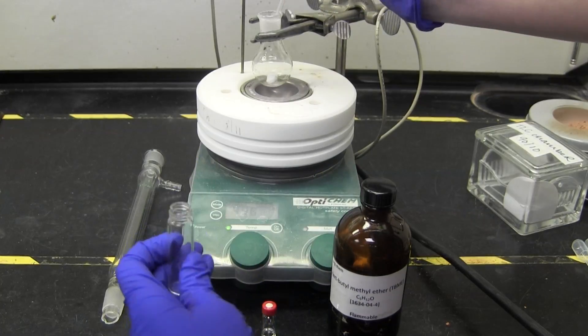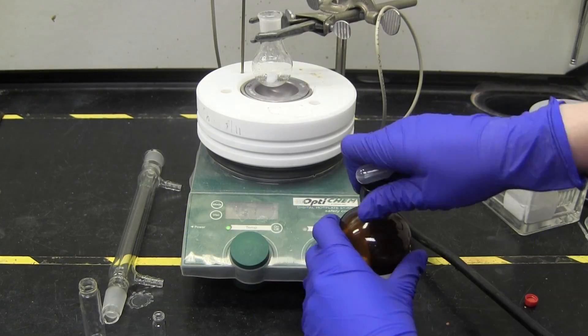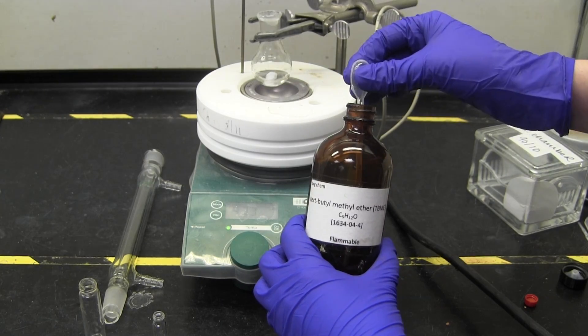To start the reaction, you will combine the designated amount of your substrate. Remember to save out one drop of your alcohol for TLC tests. Add the acyl donor, solvent, and a magnetic stir bar in a round bottom flask.